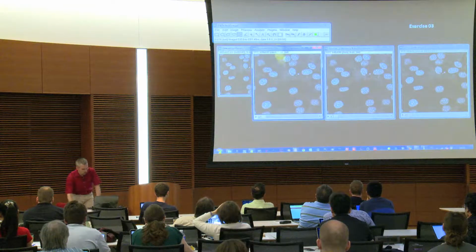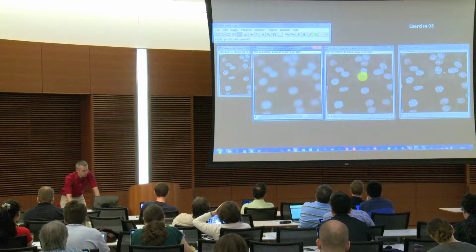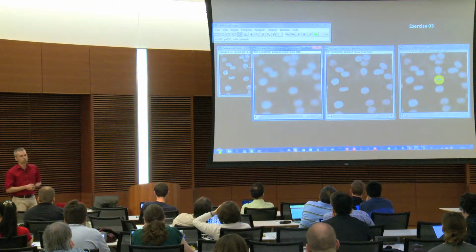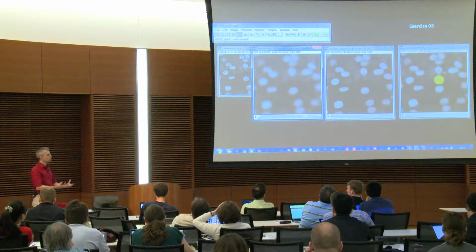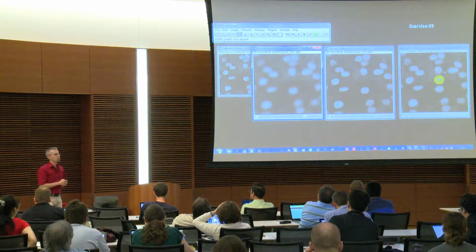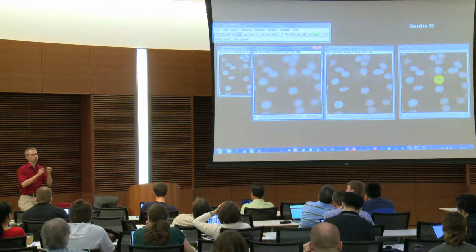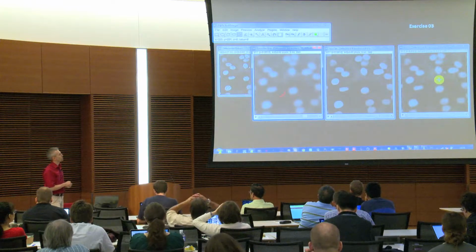So, by just looking at them next to each other, for example, if we go at a radius of around 8 or so, then you directly see the difference. The Gaussian blur obviously does a strong blurring in the way how it works, because it gives a weight to the filter and multiplies the values. So that's why you actually get a very strong blurring. That is something which might be very helpful if you have a very noisy image and you only need to later on extract features in a way that you want to count spots. So you just want to recognize bright spots somewhere, then it might be helpful.